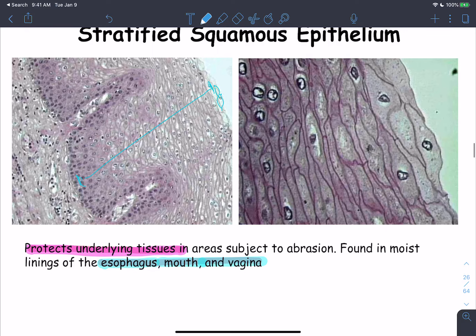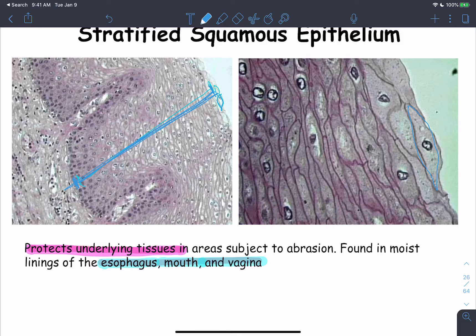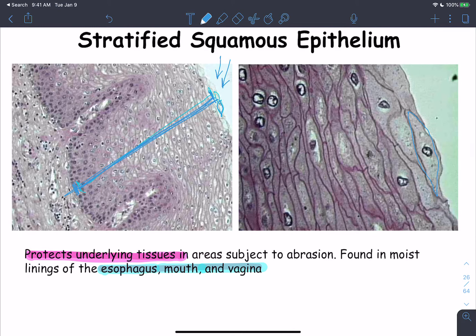Looking at clearer slides of the stratified squamous epithelium: many cell layers confirm it is stratified, and the apical cells are flat — squamous. Since there are no layers of fibers on top of the living cells, this is a non-keratinized stratified squamous epithelium.